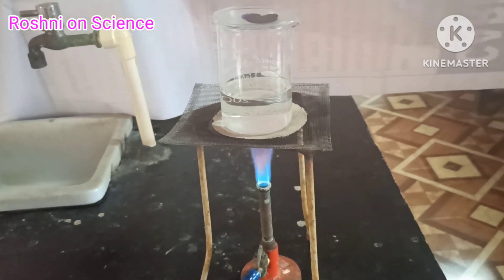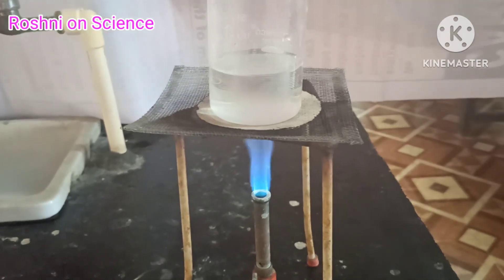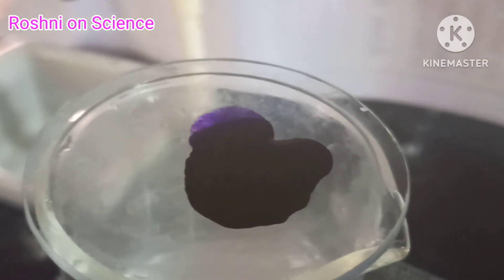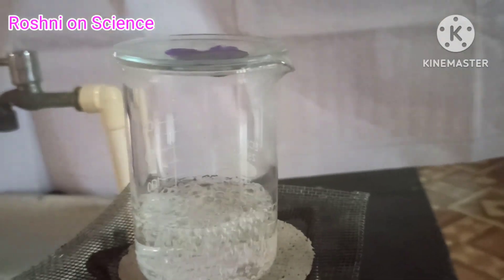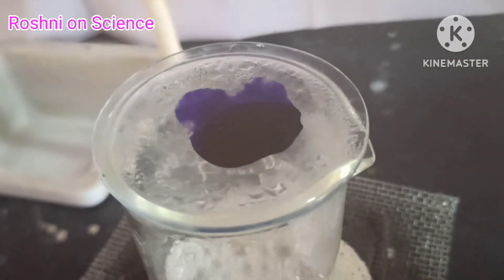Now start heating the beaker. We do not want to heat the ink directly. You will see that evaporation is taking place from the watch glass. Continue heating as the evaporation goes on, and stop heating when you do not see any further change on the watch glass.